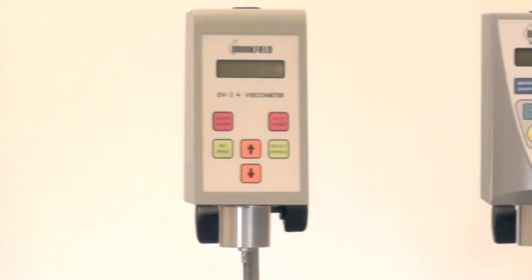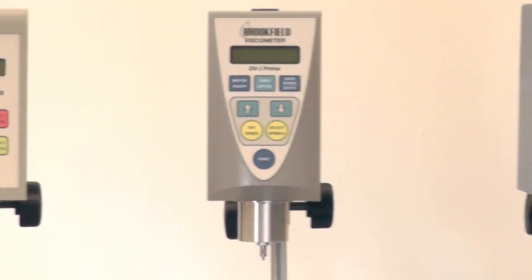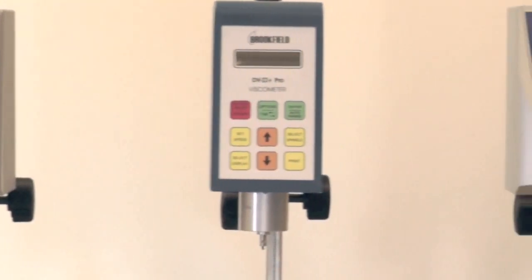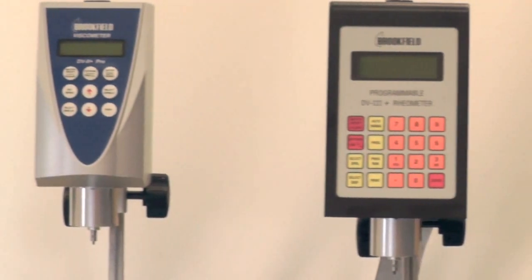We offer this EasyLock retrofit for any of our DV1, DV2, and DV3 instruments.